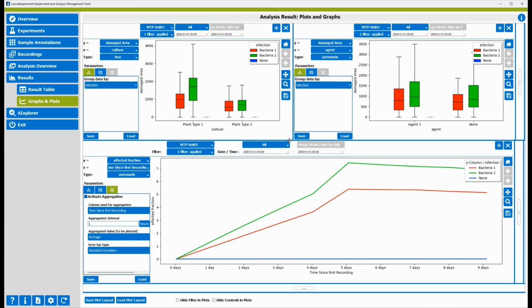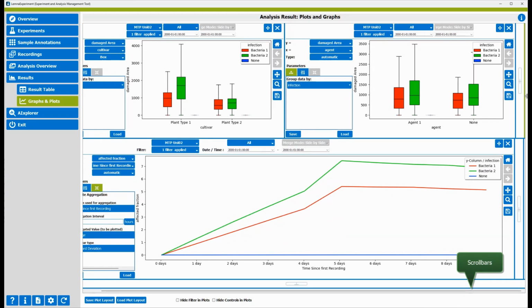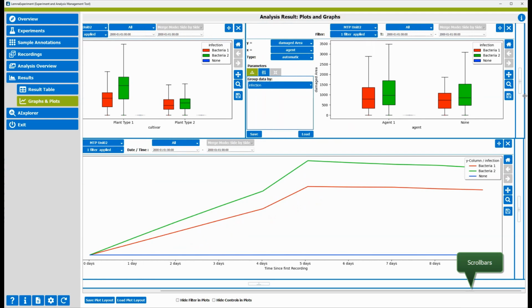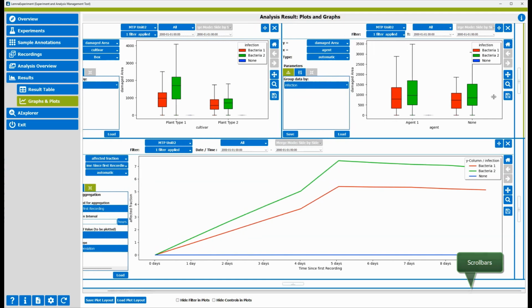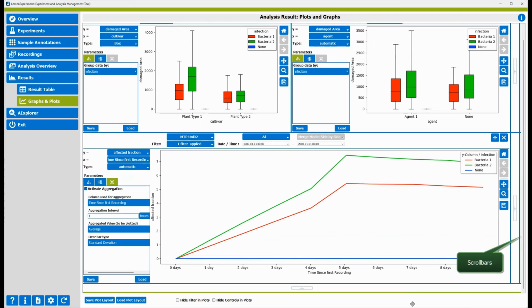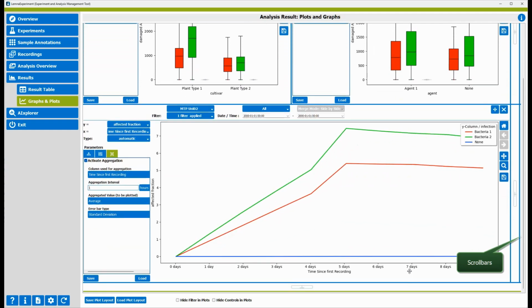This extends the plot canvas at the expense of global scroll bars. You need to move the bar to the right, even outside the window. The area increases as long as you move the cursor. To reduce the area, move the cursor beyond the next inner blue bar. Increasing the size to the bottom works the same way.